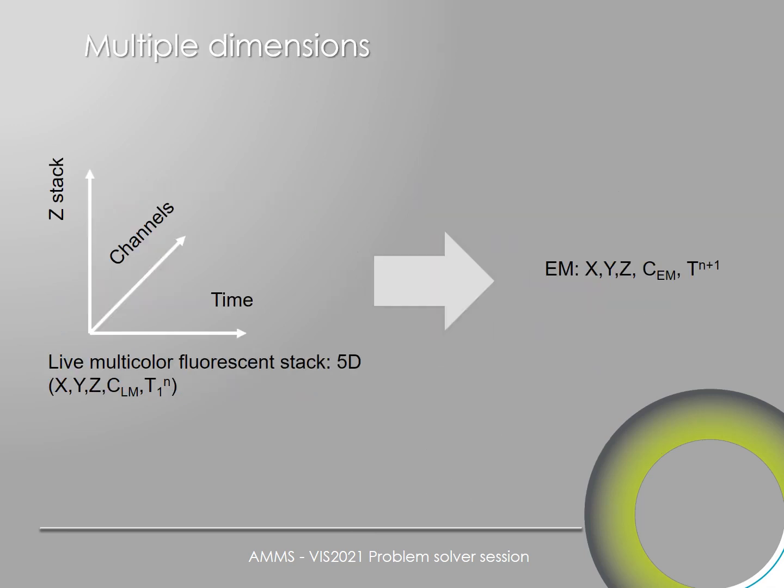So, in general, light microscopy, because I will focus on light and electron microscopy, comes in multiple channels. You have very common 2D images with only one channel, but you can easily have multiple channels depending on the number of proteins you've been tagging. But you can also have dynamic information, having a fourth dimension, and eventually you could go in 3D imaging, making it a 5-dimensional type of data set.